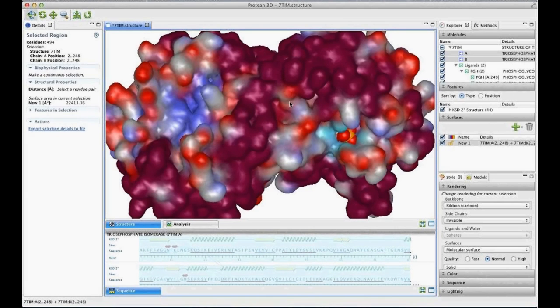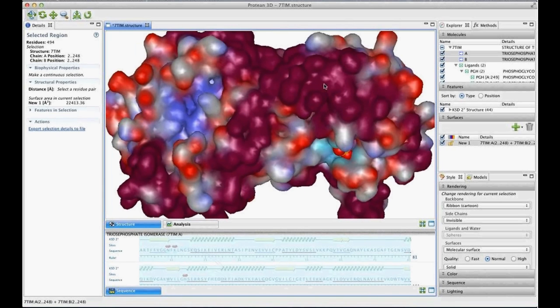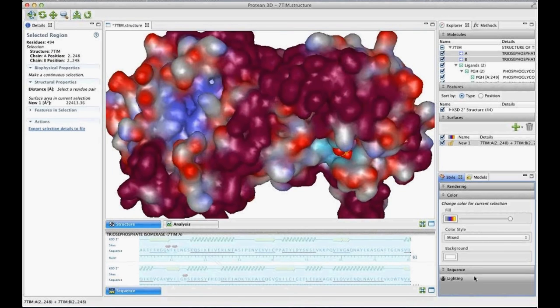As you can see, what I mentioned before, the 2 different colorations: we have all the loops that are still in the default color, which is gray for carbon, and everything in the amino acid chemistry still being colored. Whereas this pink now is the fill color of the helices that I filled to be a solid color and not indicate the amino acid chemistry. So I can easily change that by changing everything to color by element except for carbon.